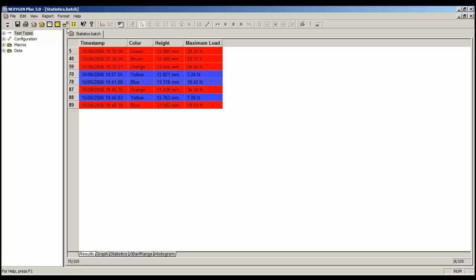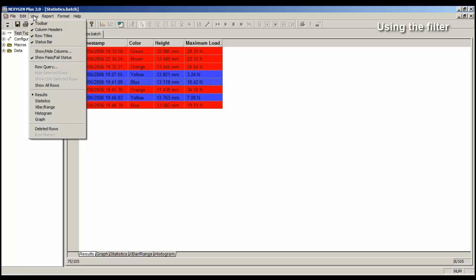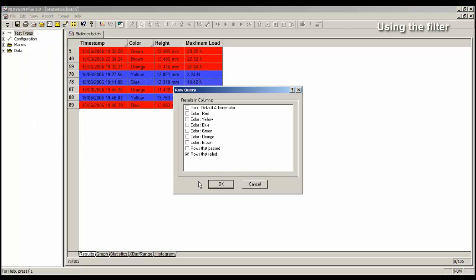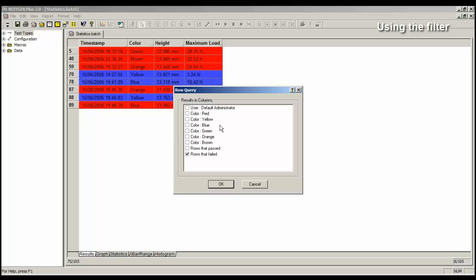To use the filter, let's go to View Row Query and we can now see that we have options for each individual colour in the colour column. So if I'd like to look at the statistics for the red sample, I will select red.